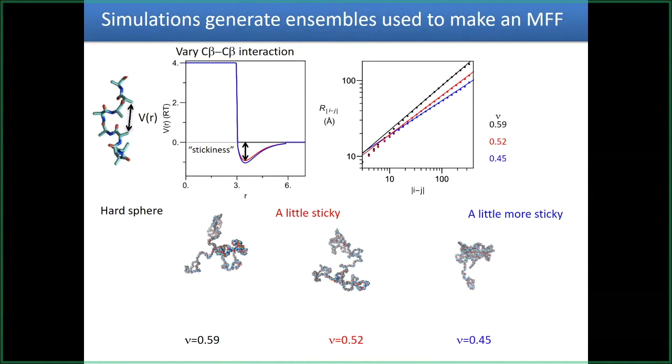We have a real backbone. We tested, in fact, different Ramachandran maps, and it didn't make any difference. People can get the scaling behavior just by connecting spheres. So at the length scales you're looking at here, whether I have five atoms or one pseudo atom, it's not really going to make much of a difference. That only shows up in this region or at super high Q, where those sorts of effects are going to show up.